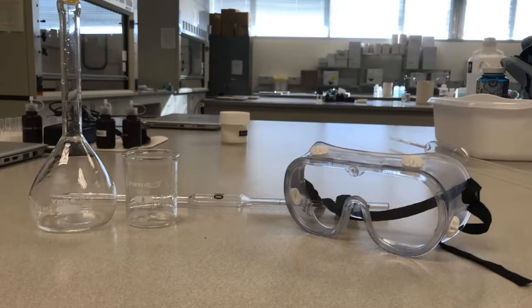At all times, you should be wearing your safety goggles and proper attire. You will be dealing with glassware, so be careful not to break or drop it.